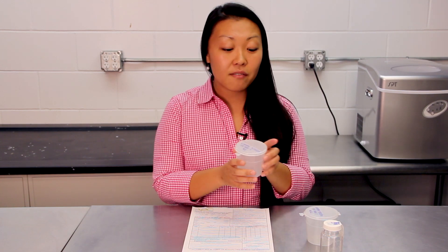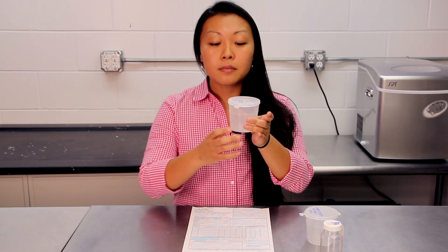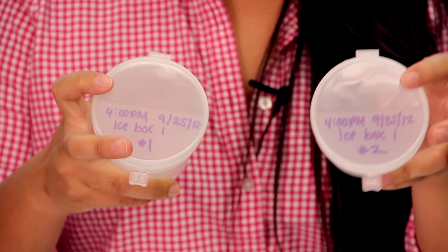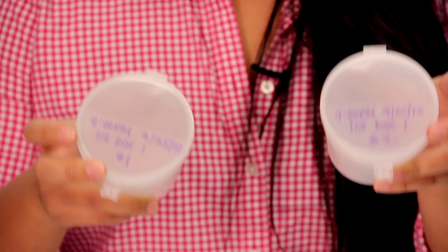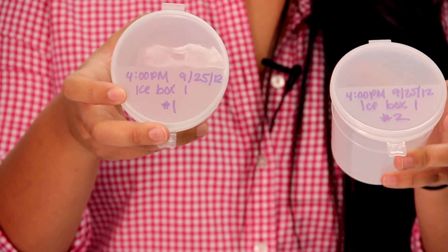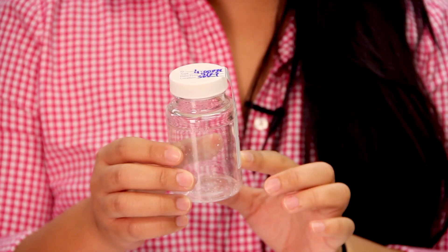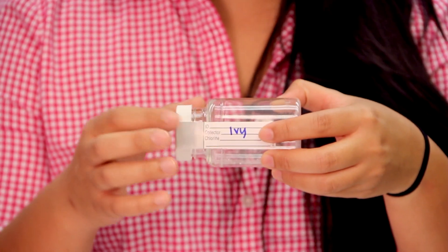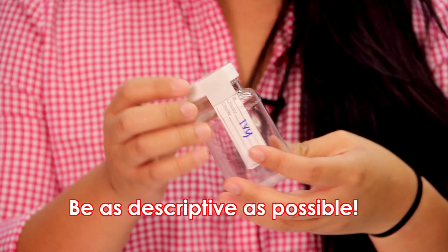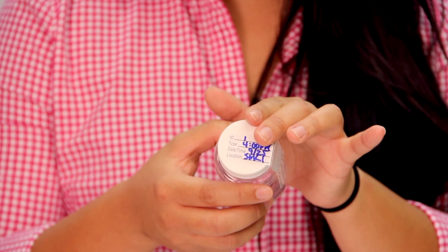I have already labeled my specimen cups. This one is specifically for ice — these ice cups have a clear area and a white area, and you want to write on the white area. The other specimen cup is for water, and it has the same concept. You want to label your stickers with your collector name, your time, date, and description of where you're sampling the water.